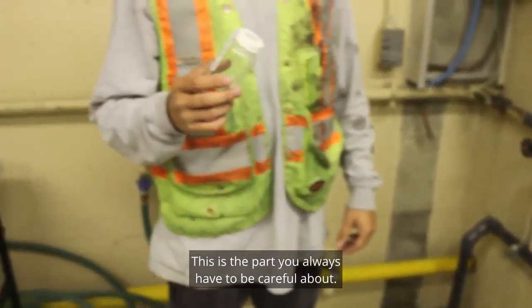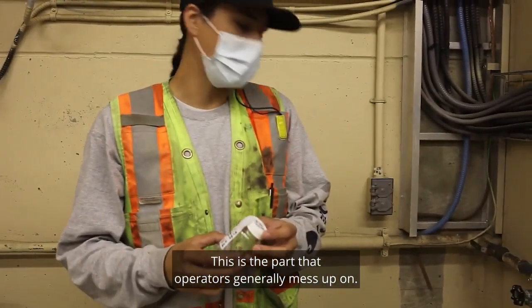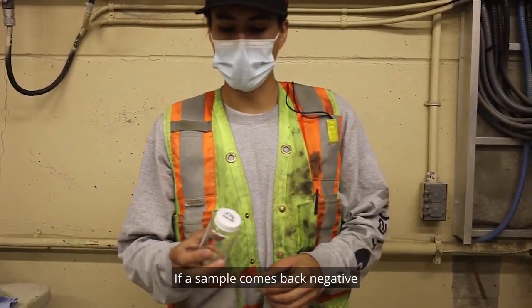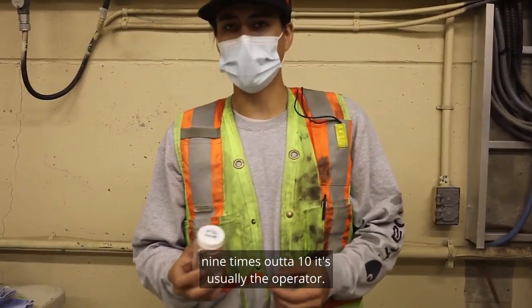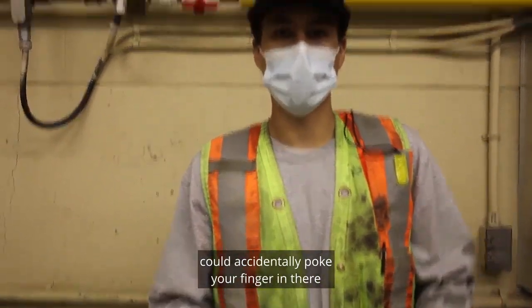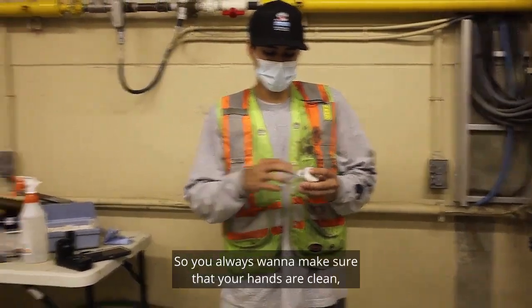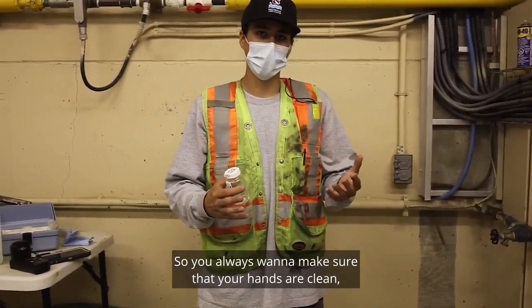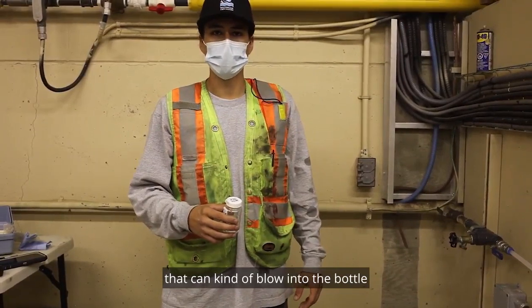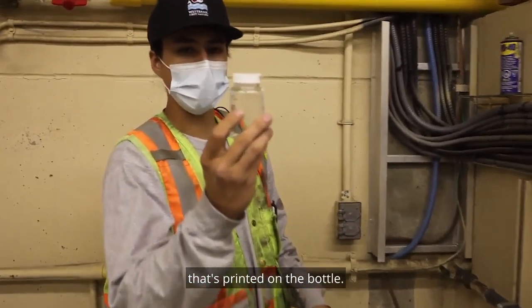This is the part you always have to be careful about — this is the part that operators generally mess up on. If a sample comes back negative, 9 times out of 10 it's usually the operator: could be breathing into the bottle, could accidentally poke your finger in there or touch something and it'll come up compromised. So you always want to make sure that your hands are clean, you've got gloves on, and there's nothing around that can blow into the bottle. Just be careful with that, and fill up to the line on the bottle.